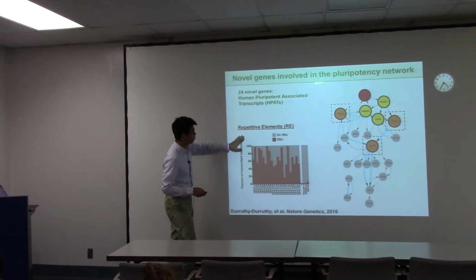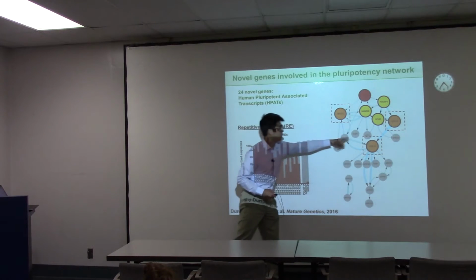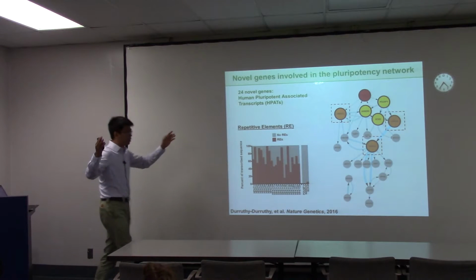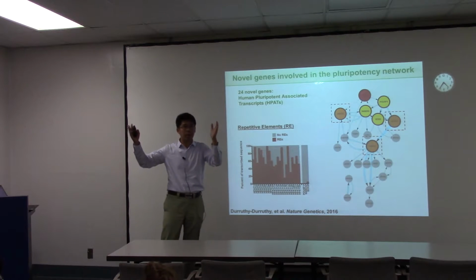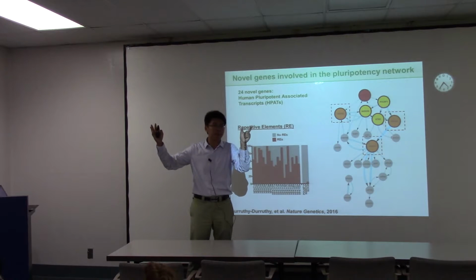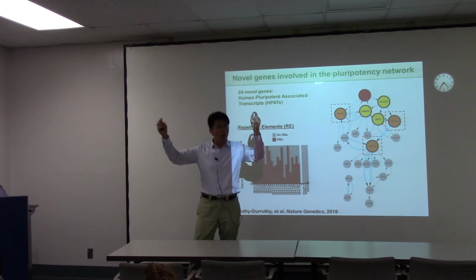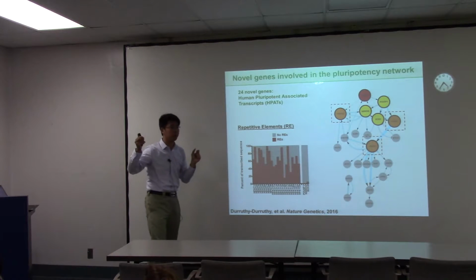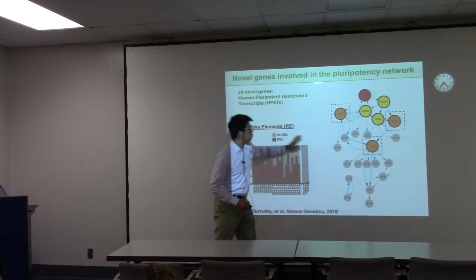Here we address your concern about why we can find it, but no peer-reviewed study could. We checked the sequence, and we find that about 70% of the sequence of these novel genes is repetitive. Only a small proportion of the novel genes is uniquely mappable. So imagine that you have these genes, and this part is repetitive. You have short reads aligning to here, then you will ignore them because they are multiply mappable. And you have a small part here. If you have long reads, they can capture this region and also the uniquely mappable region. The whole read will be uniquely mappable because you can capture a small proportion of the uniquely mappable region. Then we're very comfortable to say that there's something there. This is how we find these novel genes.